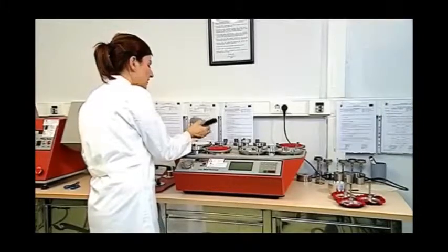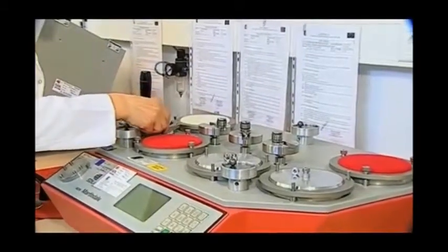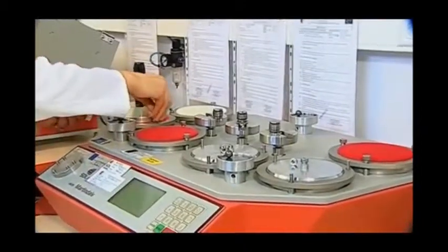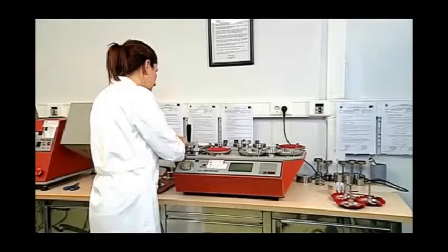After placing the 2.5 kg presser foot on the sample, the tightening screws are passed through the rings. Screws are tightened on the edges with the screwing apparatus.